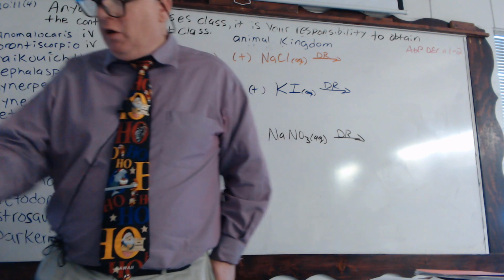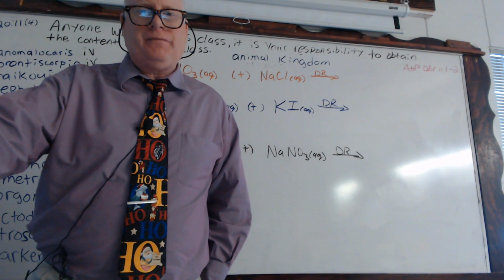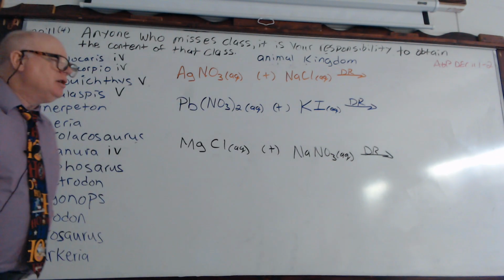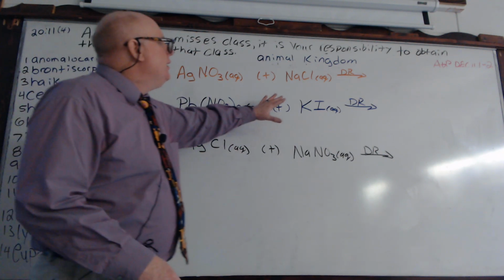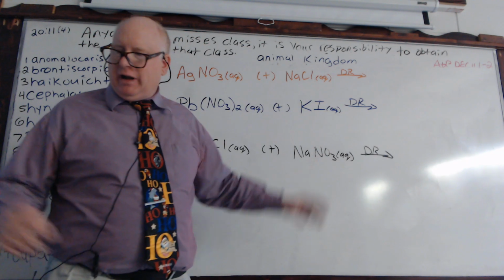All right, so we'll go ahead and get started here. And for those of you tuning in a little later, maybe it's about this time you want to hit pause so you can put all these down here. Now, some of these will react, some of them will not.